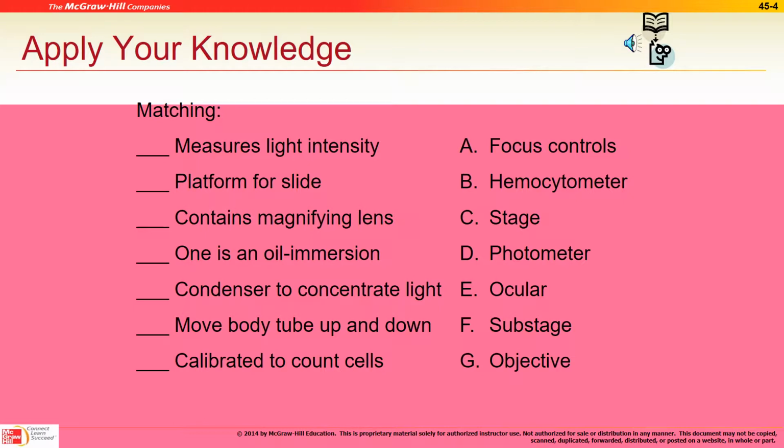All right, let's go. So these are the parts of the microscope. Focus controls, light intensity. No, they're going this way first. The platform for the slide is, of course, the stage. Contains a magnifying lens. Well, it does two things, right? So that magnifies and that magnifies.